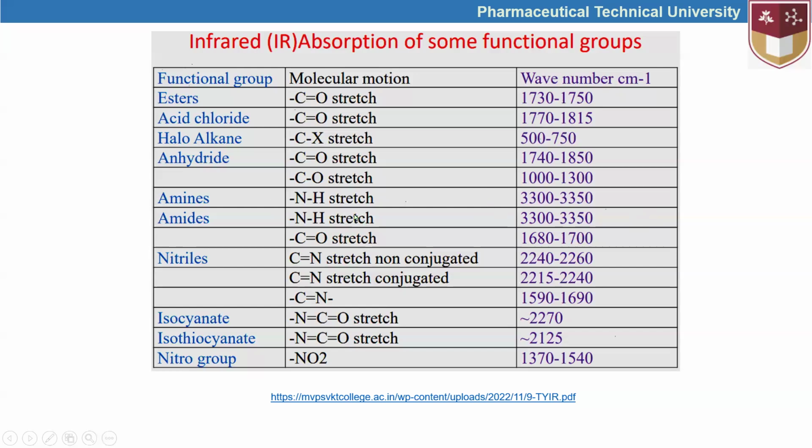In those cases, the nitrogen-carbon, nitrogen-oxygen, and oxygen-carbon interactions should be taken into consideration to suggest the presence of different functional groups.